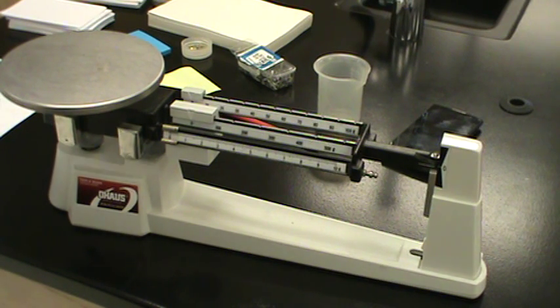One of the other forms of measurement that we do using the SI, or metric system form of measurement, is we need to measure mass. Now, please don't confuse mass and weight, because as we've learned in class, weight really is what we call a subjective number depending on where in the universe that you live.